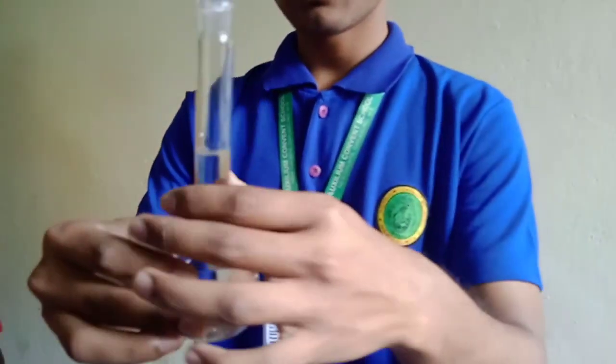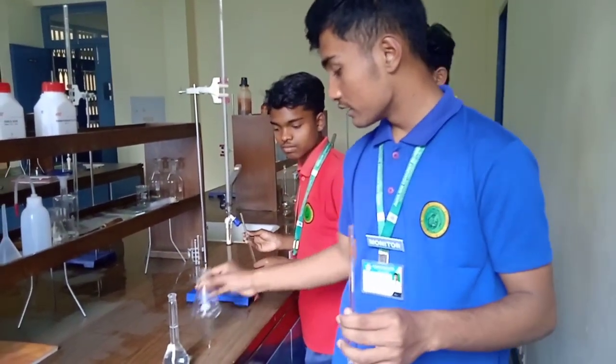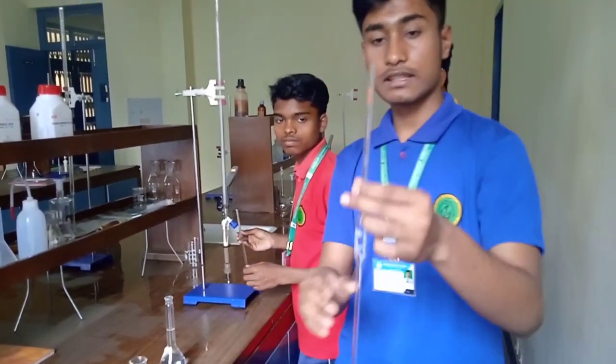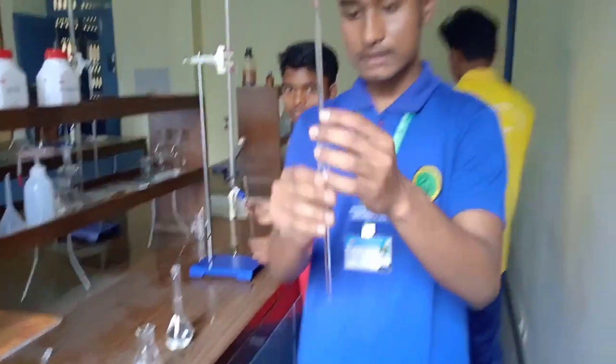So now the solution of oxalic acid is prepared and ready. Now we have to pour this oxalic acid into this beaker. We will use this thing — it is called a pipette, which is used to measure and transfer liquids, as you can see the measurement markings.